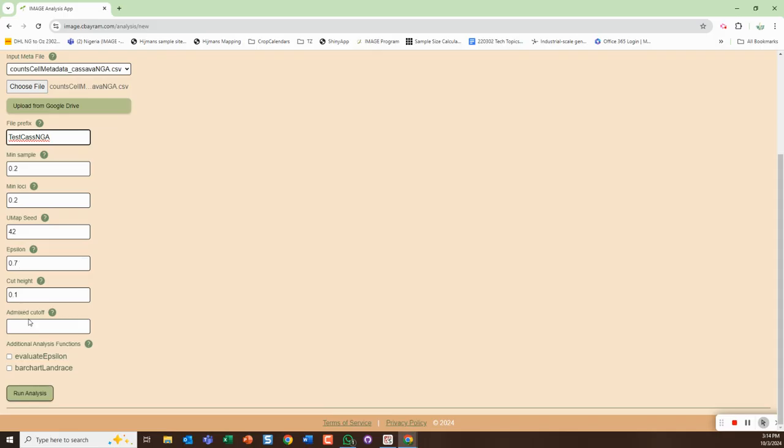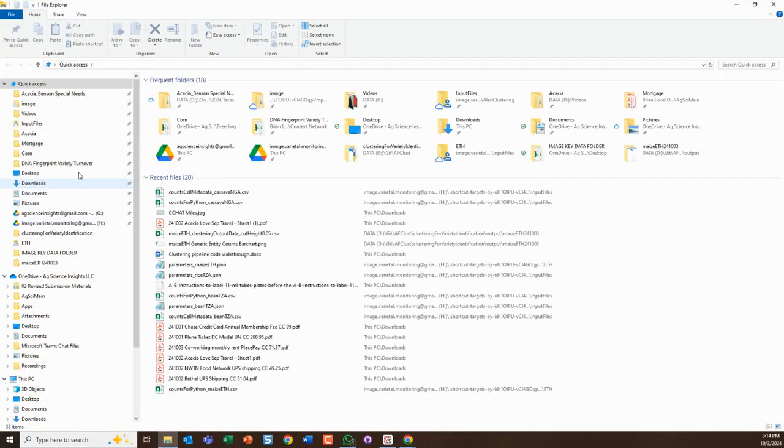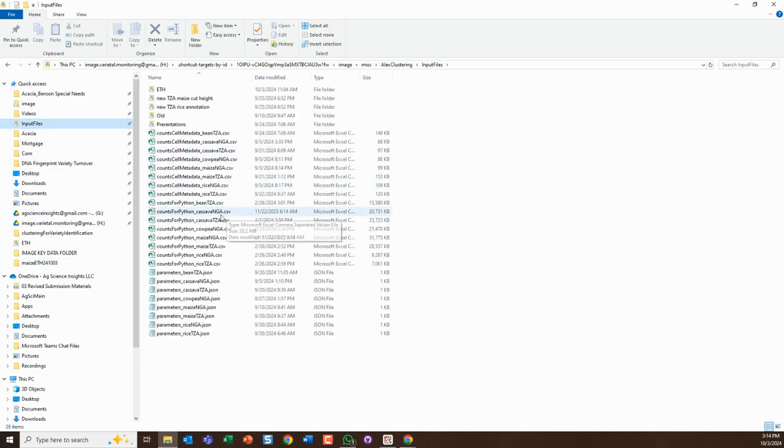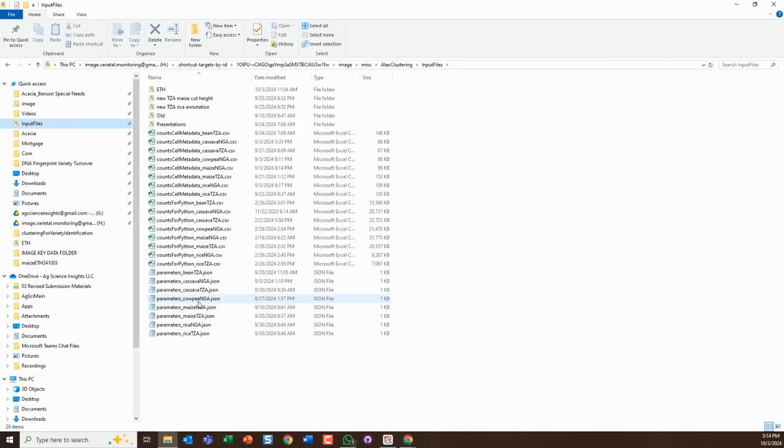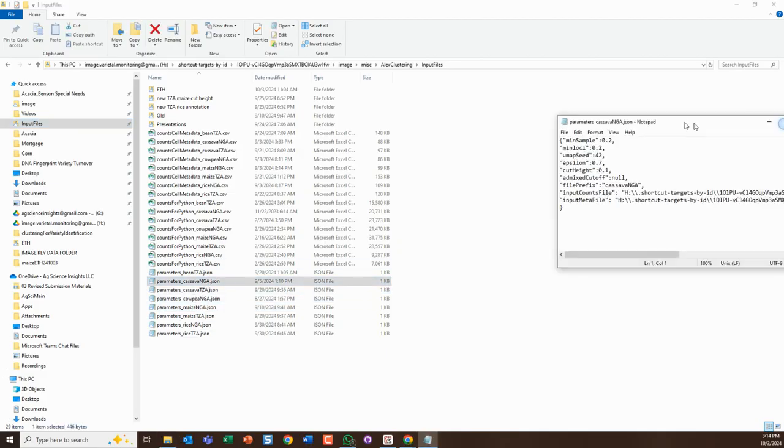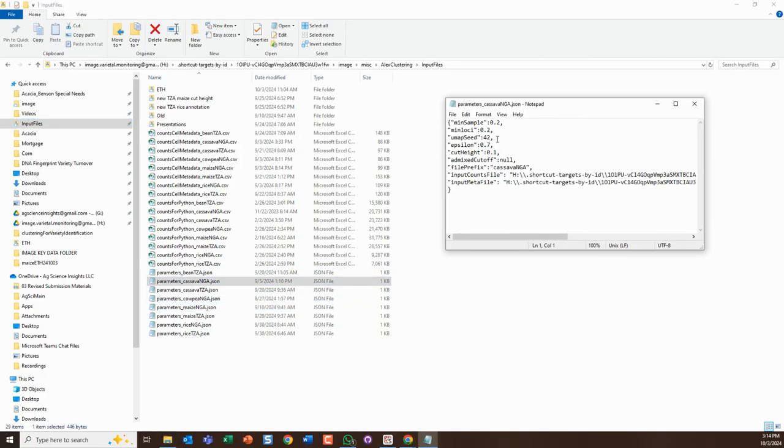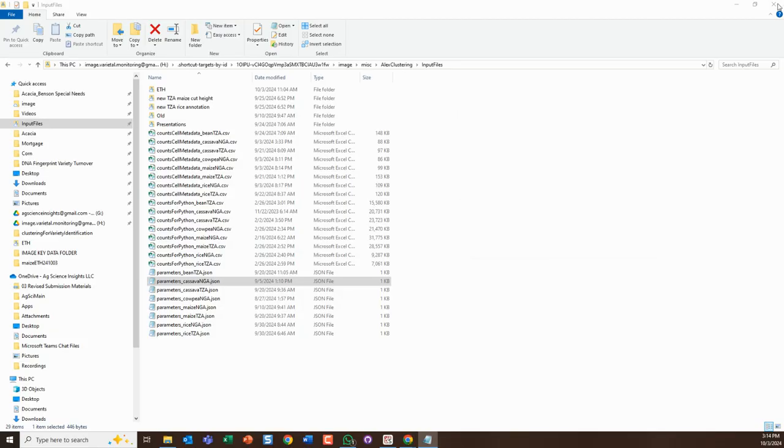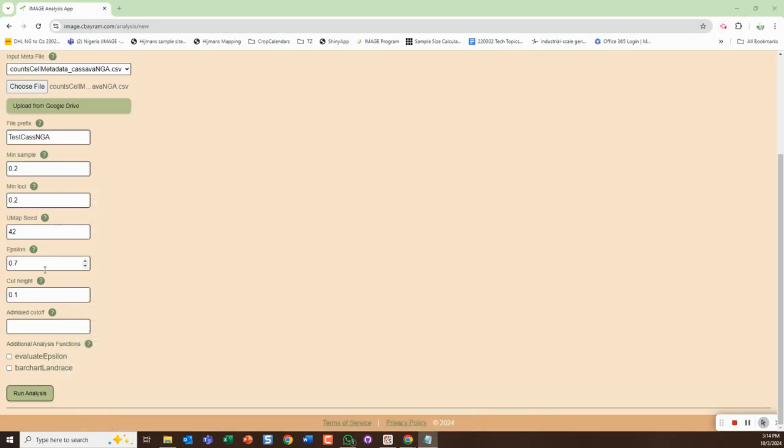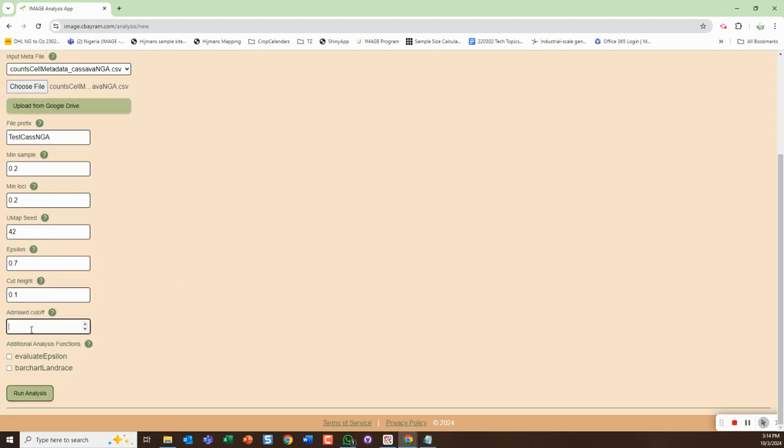You need to set epsilon and cut height. I'm going to go and look them up for this, so parameters cassava NGA. You can see here point seven and point one - that's what was used, so I'm going to use that: point seven and point one. It happens to be defaulted to that.